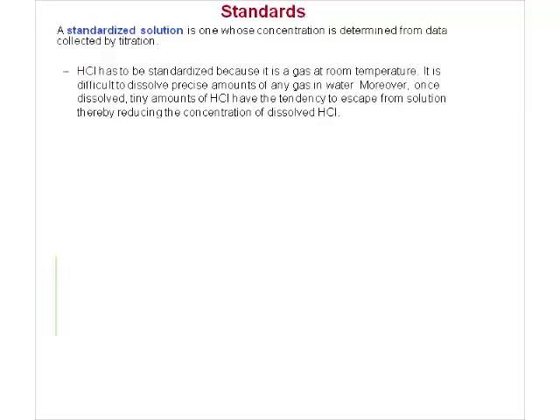In this case, hydrochloric acid is not a good standard. You may go to your chemical cabinet and find hydrochloric acid on your shelf, and it says 0.100 moles per liter, and you say, yeah, that's perfect. No. The problem is hydrochloric acid is created by bubbling hydrogen chloride gas through water, and it dissolves. What happens is if the cover is left off the hydrochloric acid, it does something like a can of Pepsi or a bottle of Coke when you leave the cover off it.